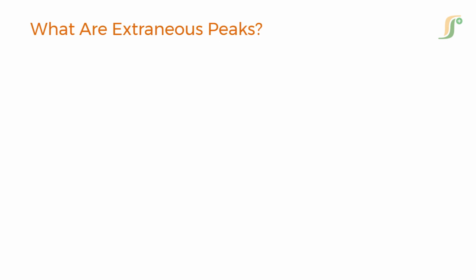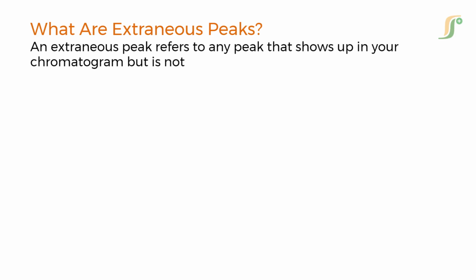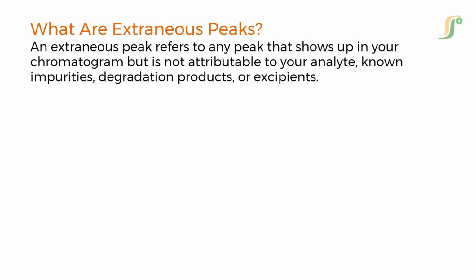Let's start with the basics. What are extraneous peaks? In chromatography, an extraneous peak refers to any peak that shows up in your chromatogram but is not attributable to your analyte, known impurities, degradation products, or excipients. In other words, they are the unexpected guests in your analytical party.